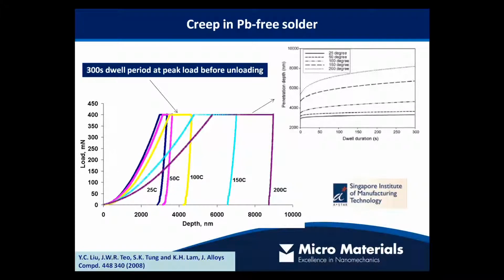So here we have some work that was carried out by one of our customers in Singapore, where they carried out indentation measurements from room temperature up to 200 degrees Celsius. What they're particularly interested in is the creep, the time-dependent behavior of these materials as they go up through this temperature range. It's quite useful and fairly straightforward to extract things like creep activation energy from these data here on the right, which are basically these sections of data. So we've loaded up here, finished loading, then held for a period of time, during that period of time the indenter continues to travel into the sample surface.